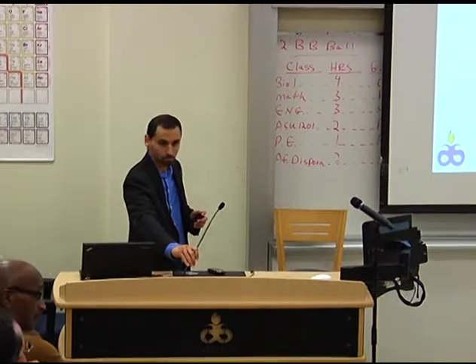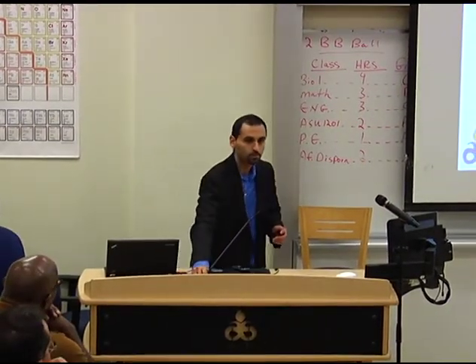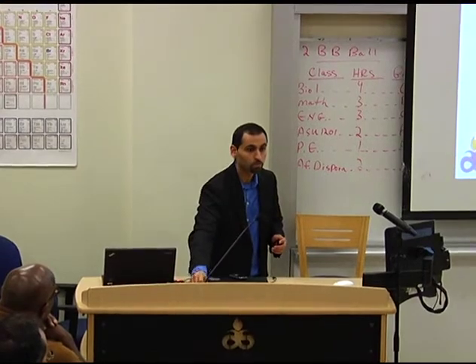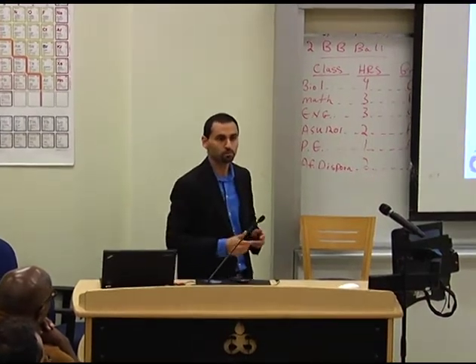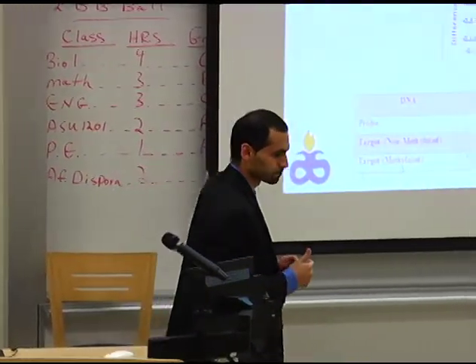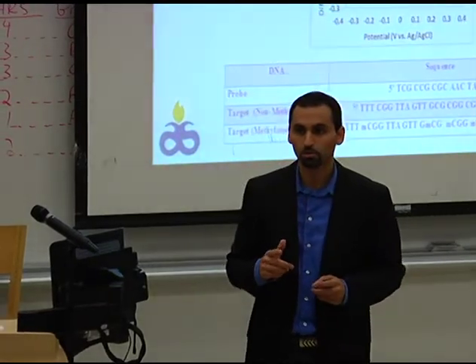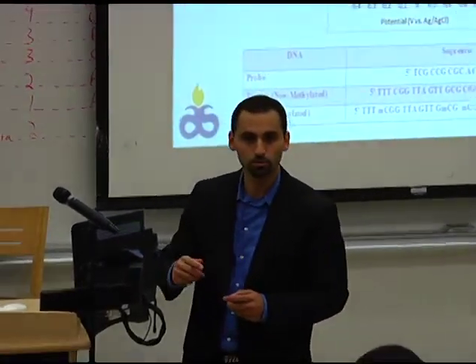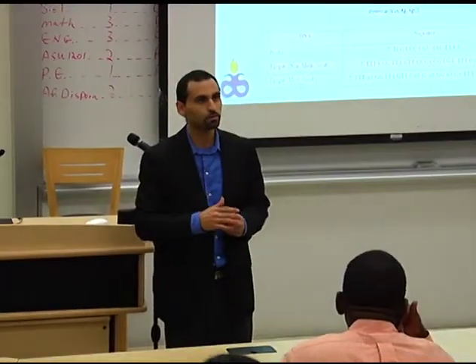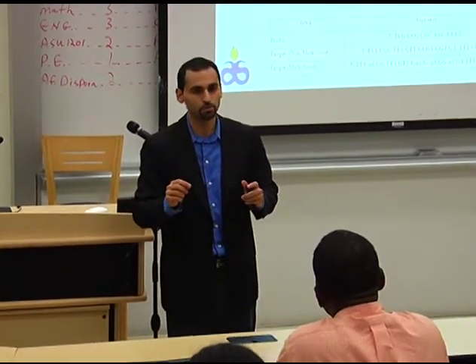So this experiment... What is the source of uracil again? Source of what? Uracil. Well, the uracil is just a variation of the cytosine going through the bisulfite. The source of it in these experiments? The DNA itself. Maybe the RNA? No. The DNA itself, so through a process, it's about three different treatments when you do the bisulfite kit.